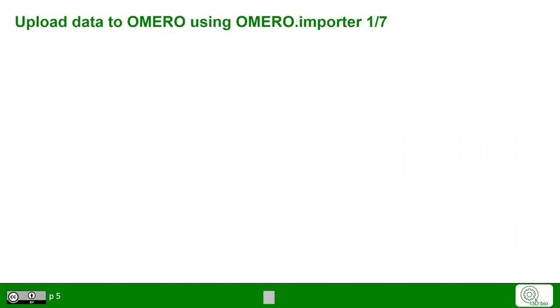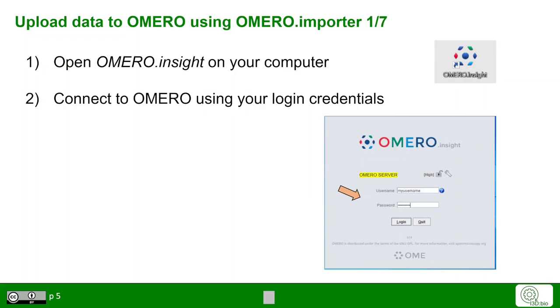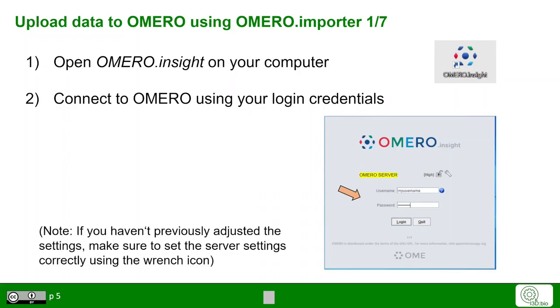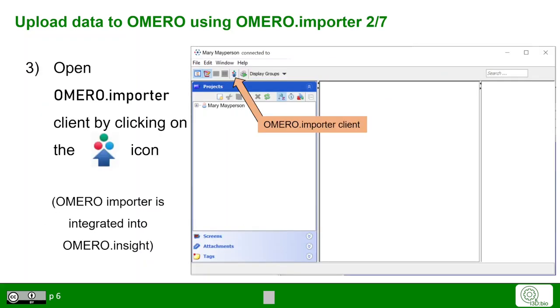Let's take a look at data upload using Omero Importer, for which you need to open Omero Insight on your computer and log in with your login credentials. If you haven't previously adjusted the settings, make sure that the server settings are correct by using the wrench icon. After logging in, you can upload data to Omero by using Omero Importer, which you can choose by clicking on the respective icon.